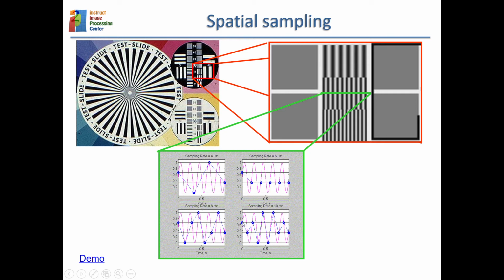So here you have the example. So here you have a sinusoid, a period of that sinusoid, and then we have 2 samples in that period. We have these 2, and then we have another period, and then we have again 2 samples, and then we have another period, and we have these 2 samples, and so on. So as long as you take 2 samples per period, it doesn't matter if in the computer it doesn't really look like the perfect sinusoid, but you are able to recognize that you have that sinusoid, and you may relax that condition.